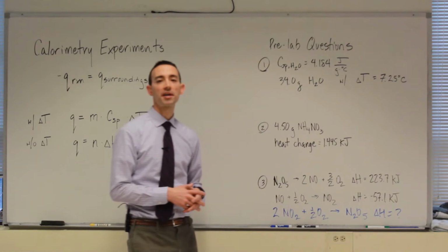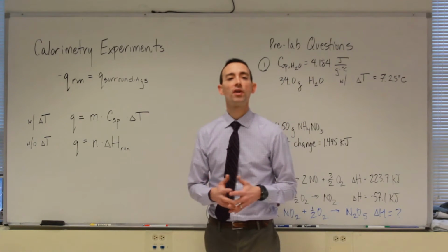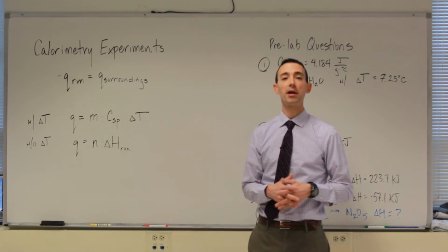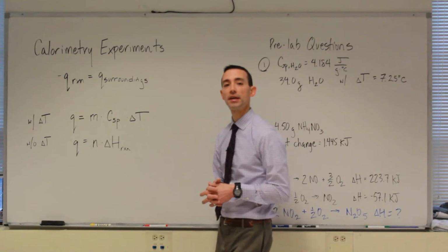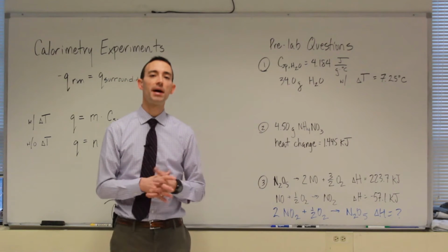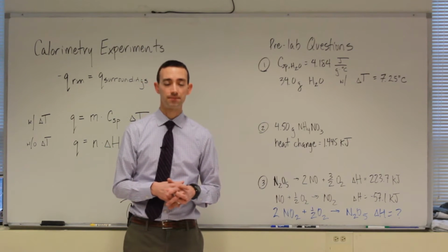So this week we're talking about our first experiment of the semester. We're going to cover safety information in lab, as it's also the first meeting of the semester, but the experiment that we'll be doing this week is the calorimetry experiments. That's where we start our study of topics in the lecture part of the course, and hopefully by now you've heard at least a few of these terms that you'll hear me use during the pre-lab lecture today.